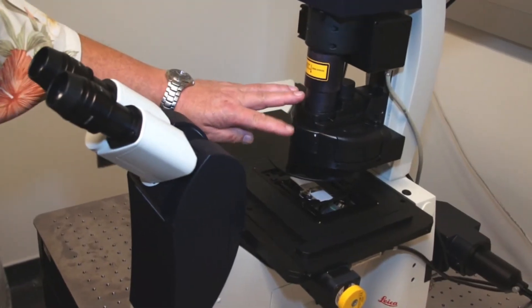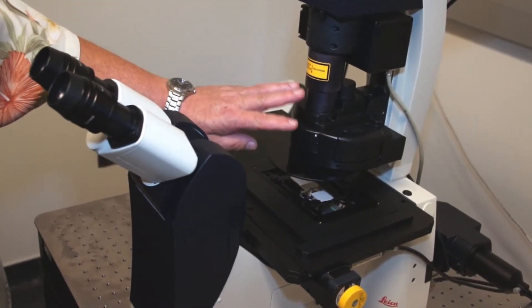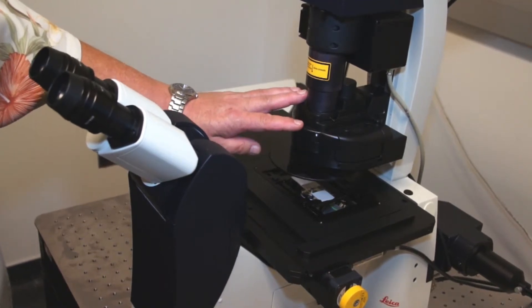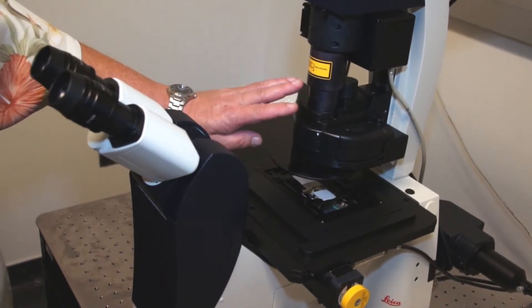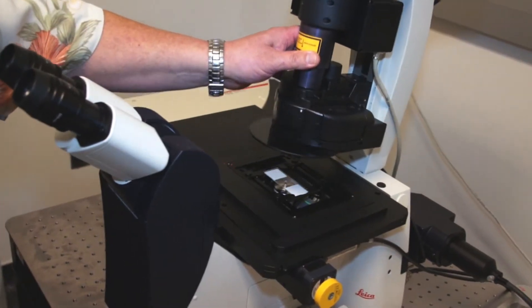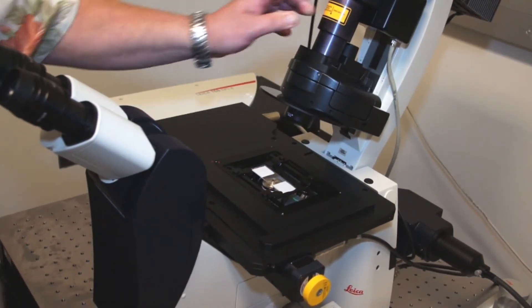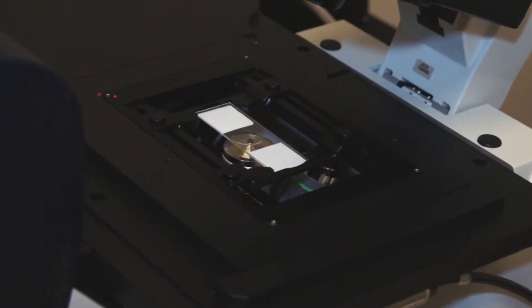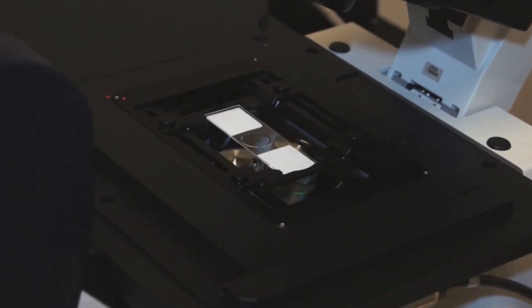We have a combination of wet objectives and dry objectives on the Leica Confocal Microscope. In order to go from a dry objective to a wet objective, we must first rock the condenser out of the way. You can see the specimen on the stage as we rotate the nose piece until we get the wet objective almost in place.